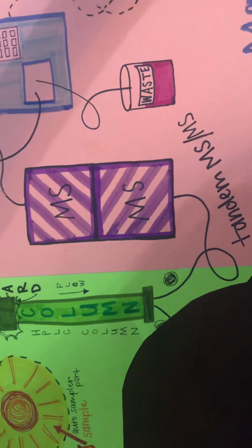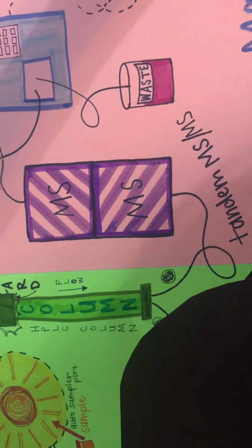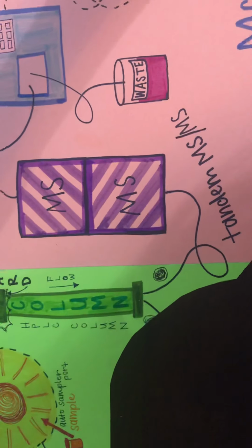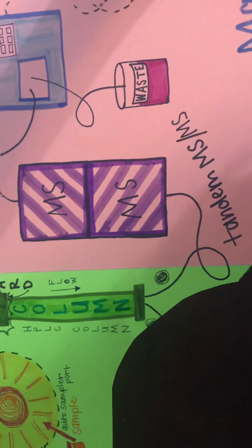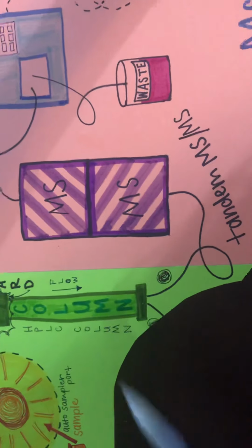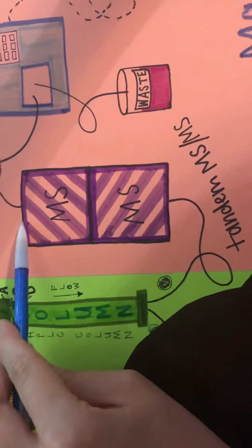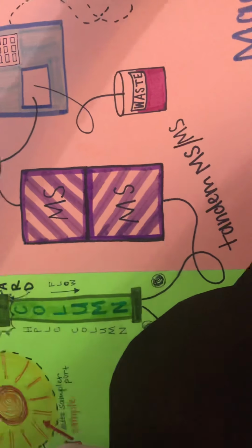And so once the samples are ionized to generate a mixture of ions, the precursor ions of a specific mass to charge ratio are selected in the first MS and then fragmented in the second MS to generate product ions for detection.